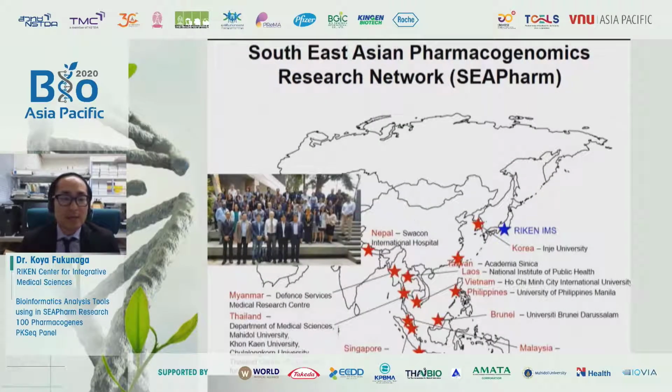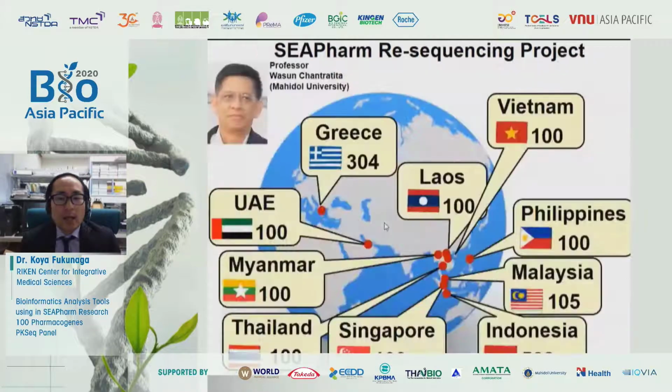And next, from this slide, we will show an application example using PKSeq. As you know, there is the Southeast Asian Pharmacogenomics Research Network. In the SEAPharm project, I'm involved in the SEAPharm resequencing project using a PKSeq panel.